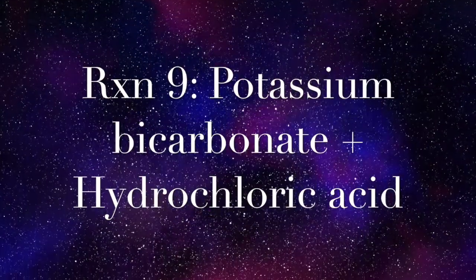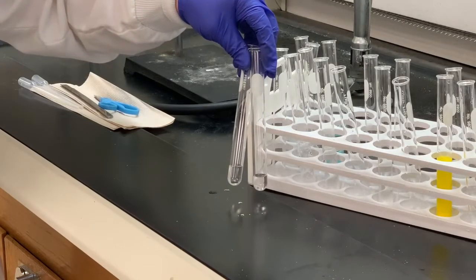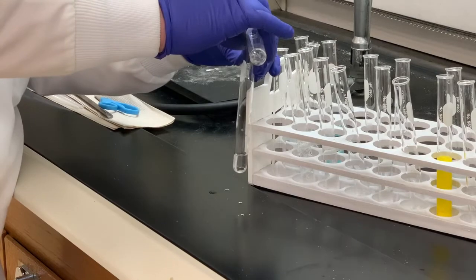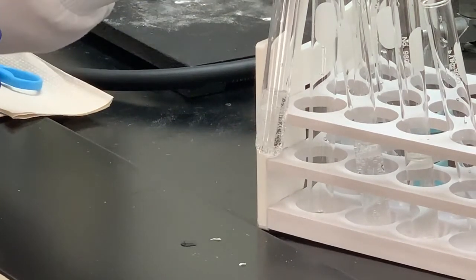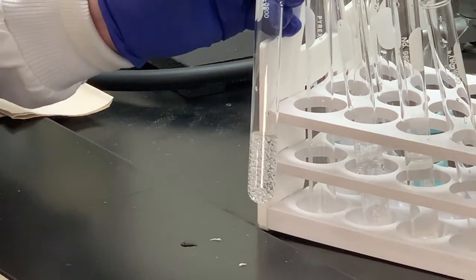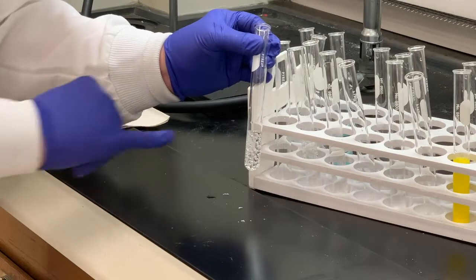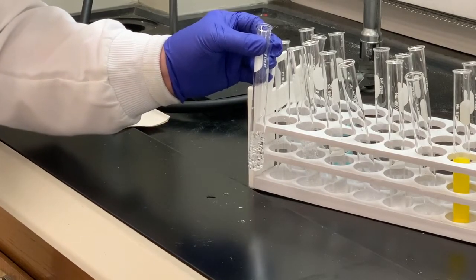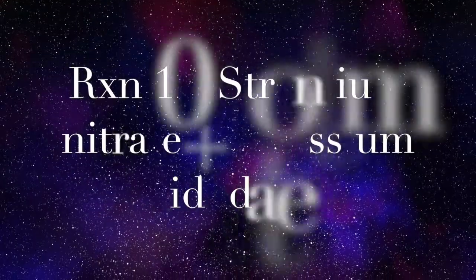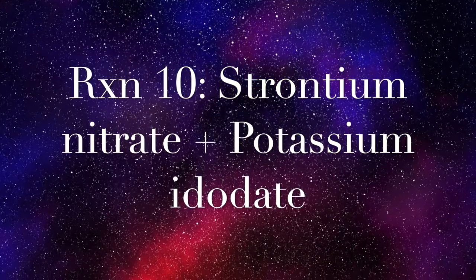And then the next one, we've got potassium bicarbonate and hydrochloric acid. So two colorless solutions. And if I add one to the other, notice you'll see those bubbles rising to the surface. I can see through it, so no precipitate. I do not notice a temperature change, but you can see that steady stream of bubbles rising to the surface, so we formed a gas. So did a reaction occur? We would say yes.